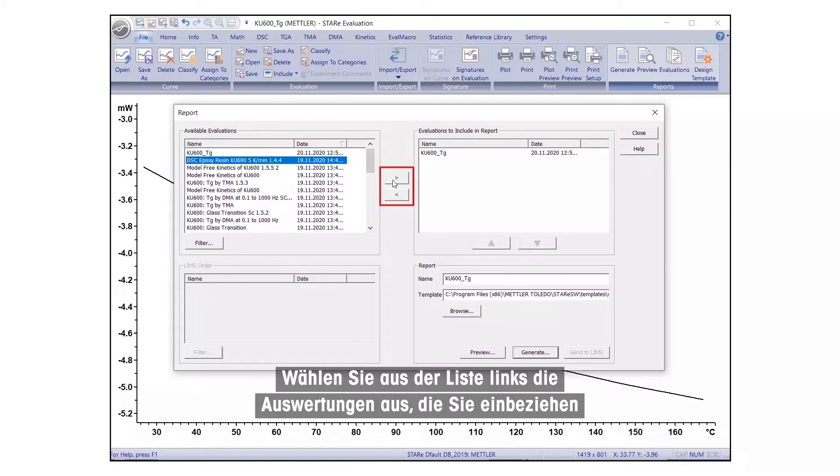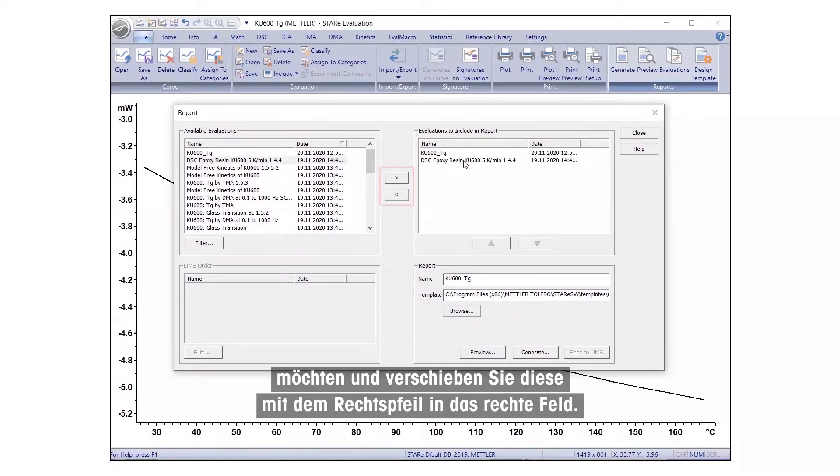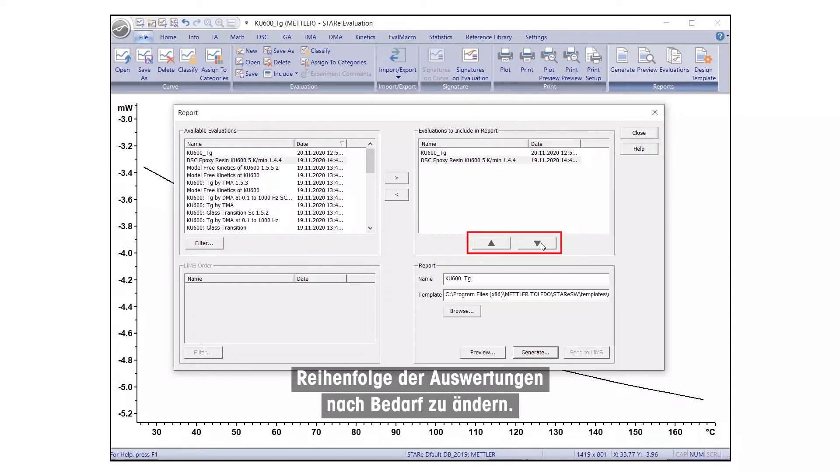Select the evaluations you would like to include from the list on the left, and move them to the box on the right, using the right arrow button. Use the up-down arrows to change the order of the evaluations, as needed.